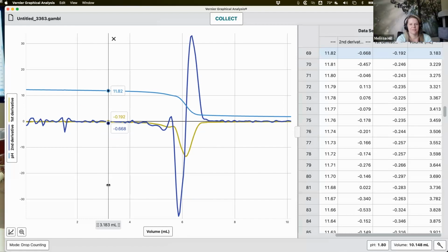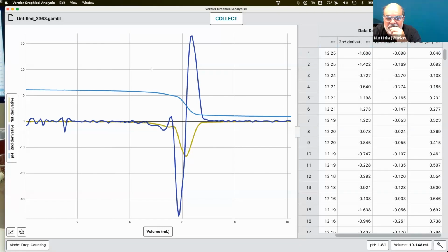Now this is getting pretty busy too. Wouldn't it, once again, rhetorical question, wouldn't it be nice if we could make this a little cleaner? Top right corner where the view options are, let's turn on two graphs. There's also a three graph option, but they get kind of skinny. So I'm going to turn on two graphs.